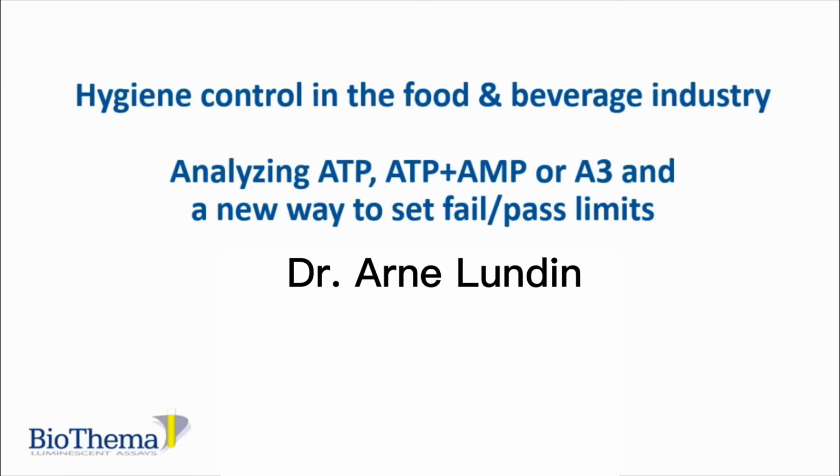First of all, I would like to pay my tribute to Dr. Mikio Backe and his colleagues at Kikkoman. He and his group have developed the assay of ATP+ADP+AMP called A3. They have since then successfully applied the A3 assay as an indicator for bacteria, viruses and allergenic food. My presentation today is almost entirely based on their data. I think their work has resulted in a major step forward in rapid hygiene control.